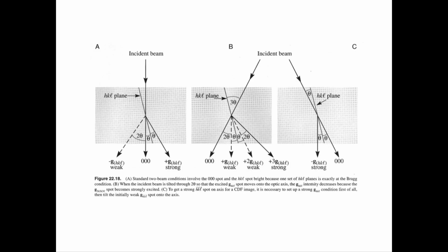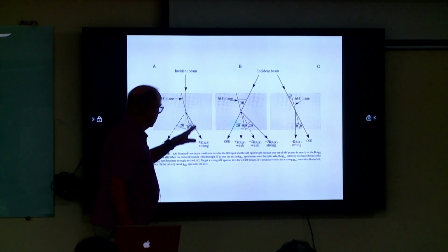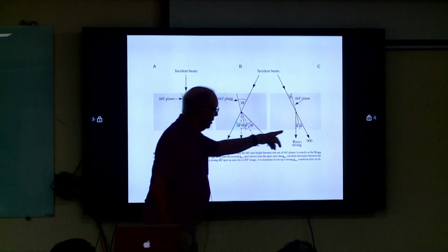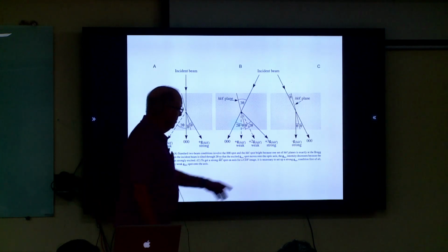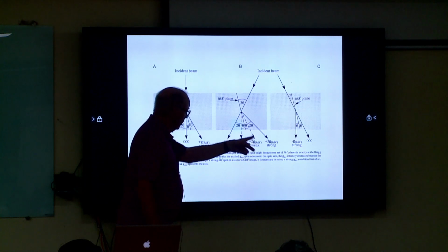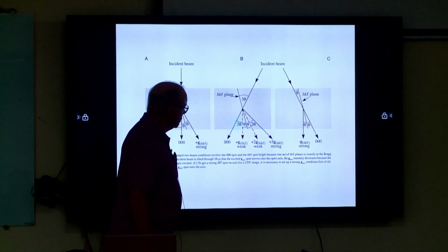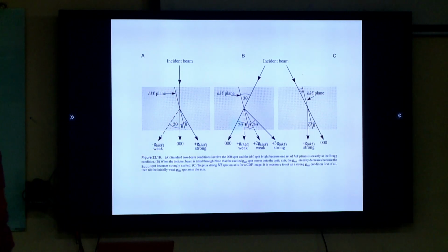So this is the way to set up bright field imaging. This would be for G plus G, and this would be in this particular orientation. This would give rise to a strong beam here and a weak beam for the minus G. And if you just took that minus G and put it into the middle here, then we end up with a strong G dark field minus G beam. And as we said here, if we actually just brought this guy in, so that's now here, it turns out to be weak, and it's 3G that's at the Bragg condition, and you can work that out by just taking, look, there's 3G there, and hence it's at the diffracting condition. Okay.